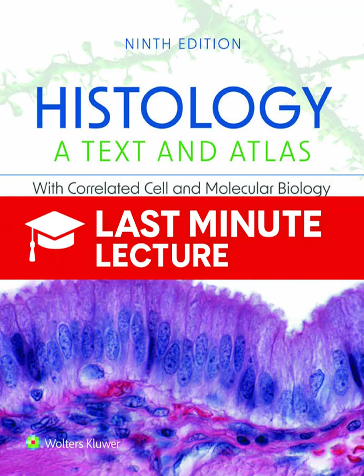You mentioned earlier that staining is all about chemistry, specifically electrical charge. Let's dig into that a little deeper, the actual mechanism of acidic versus basic dyes. Okay, so you have to understand that these dyes are charged molecules. They create color by forming an electrostatic link with parts of the tissue. The fundamental concept is just opposites attract.